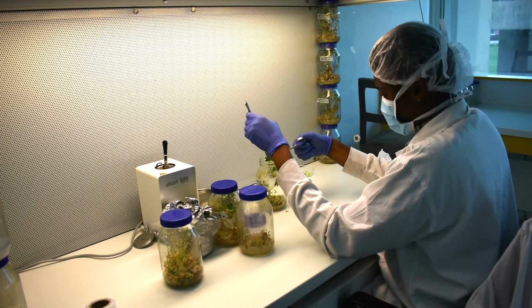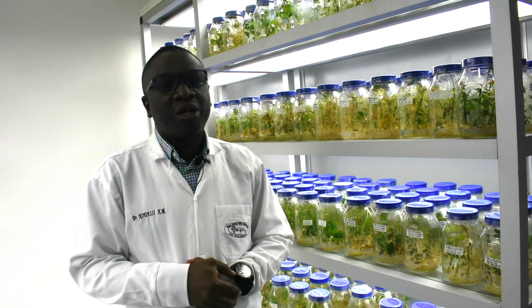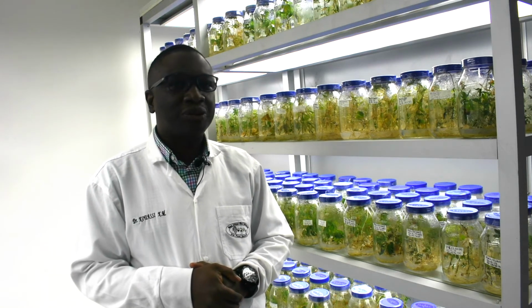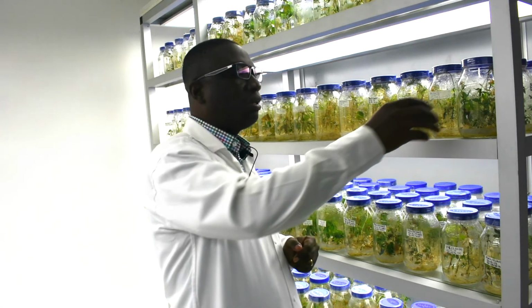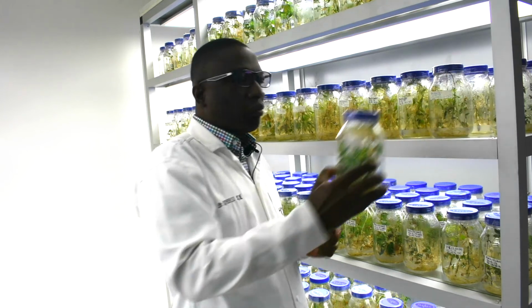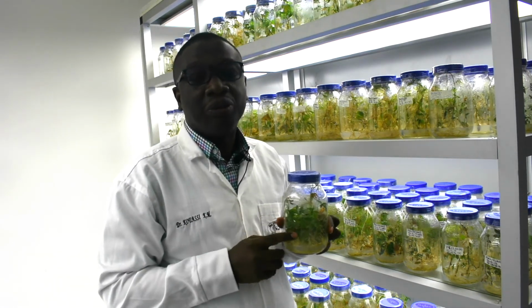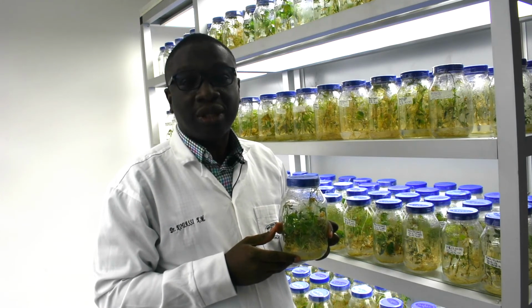So after sanitation, conservation, we are also trying to do mass propagation in order to provide planting material to the farmers. So just to give you an example of our capacity, this is the type of container we use because it's very cheap. We purchase this type of container on the local market.